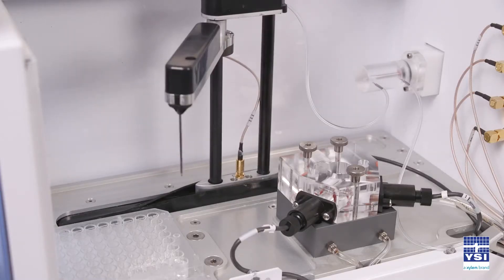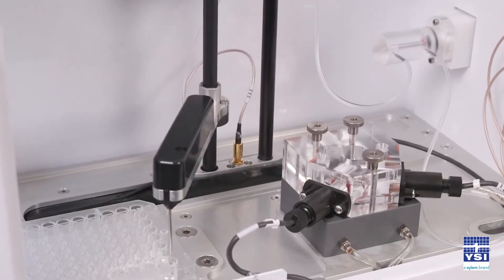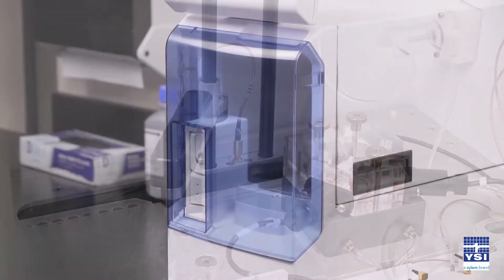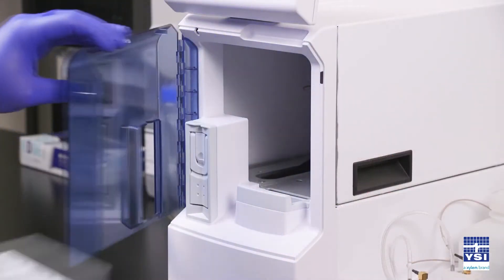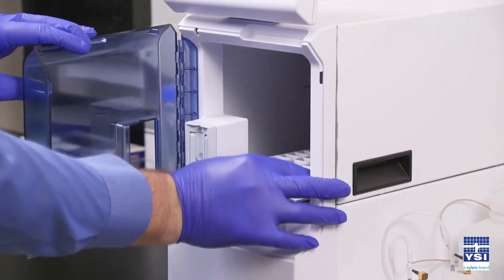The robust enzyme electrode technology allows for little to no sample preparation, as analysis is not largely impacted by color, pH, turbidity, or viscosity.